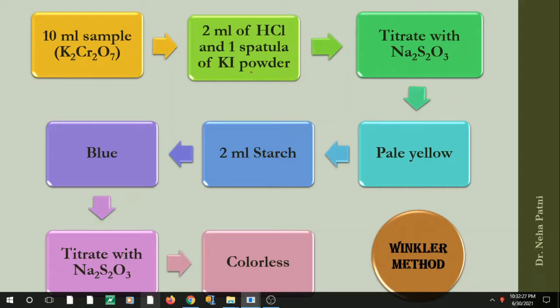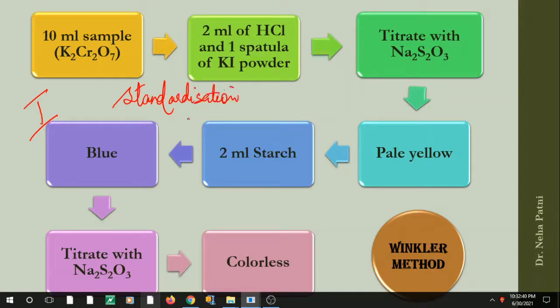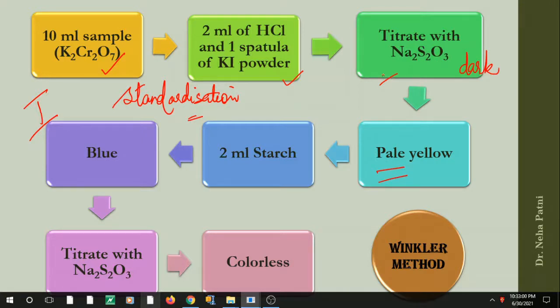The titration involves two steps. The first step is standardization of sodium thiosulfate. You titrate it against potassium dichromate, adding HCl and KI powder, then titrate with sodium thiosulfate. The color will be dark yellow; you add enough sodium thiosulfate until it becomes pale yellow. At pale yellow, you add starch as an indicator, which gives a blue color. This is an iodometric titration — you titrate with sodium thiosulfate again until the color changes to colorless, thereby standardizing the sodium thiosulfate.